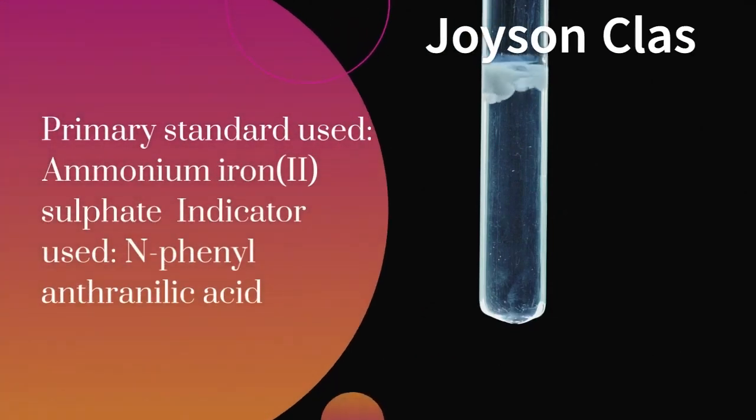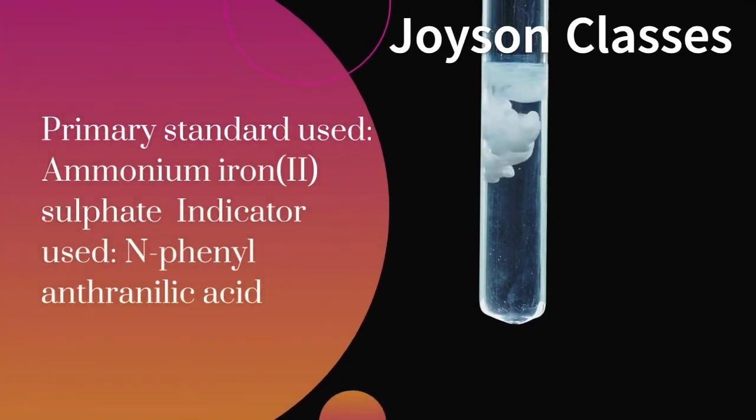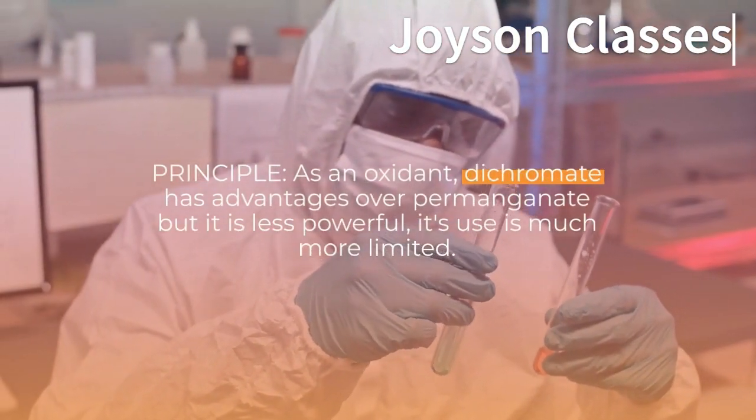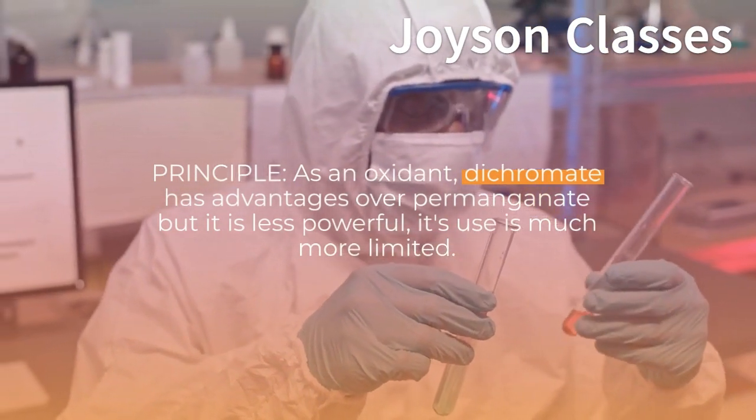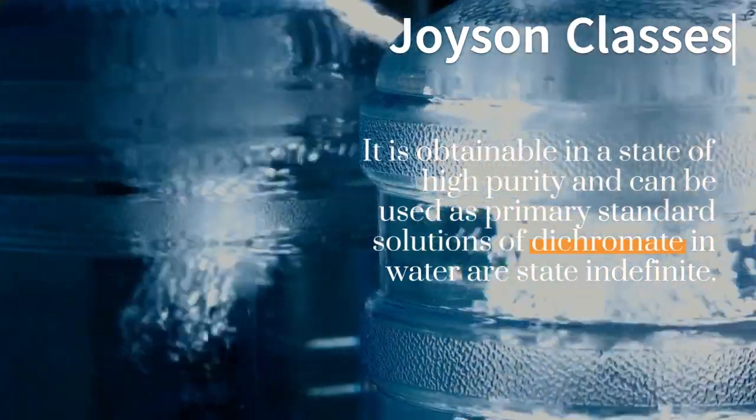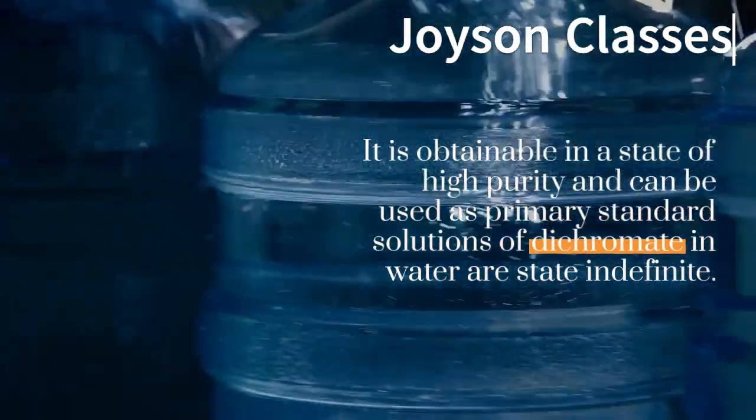Primary standard used: ammonium iron(II) sulfate. Indicator used: N-phenylanthranilic acid. Principle: as an oxidant, dichromate has advantages over permanganate, but it is less powerful, so its use is much more limited. It is obtainable in a state of high purity and can be used as a primary standard.